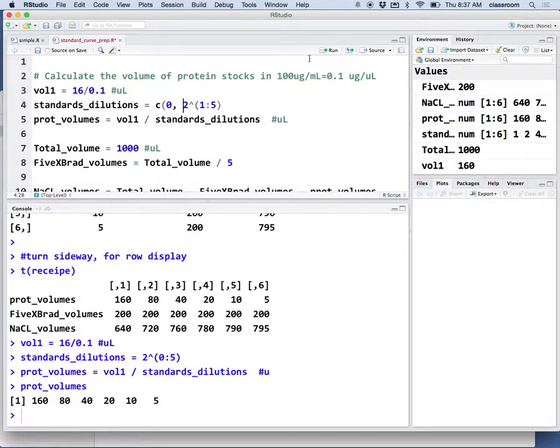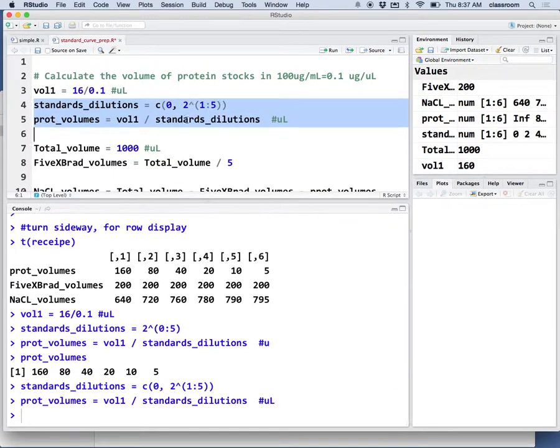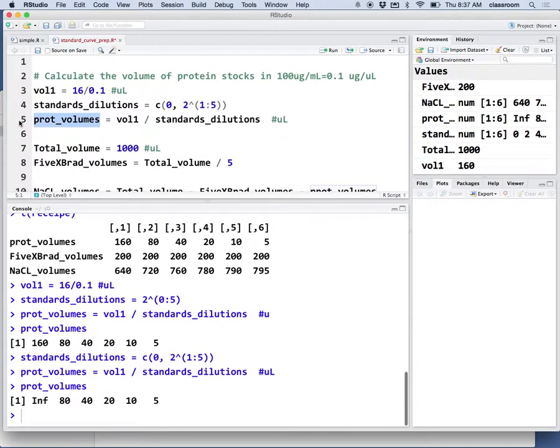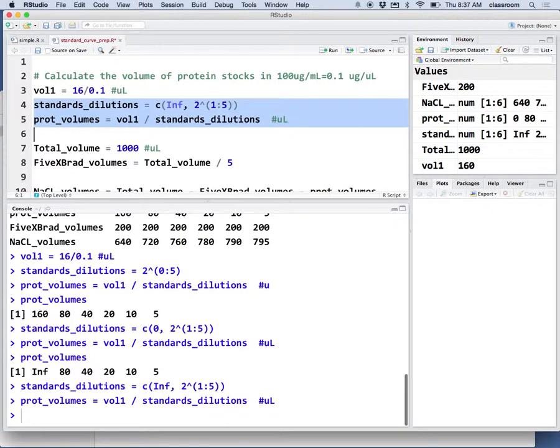Now I'm going to calculate protein volume. Oh, I cannot divide it by 0. This has to be infinite.